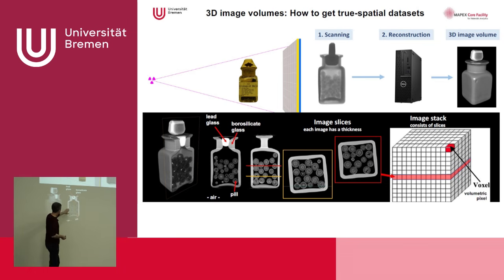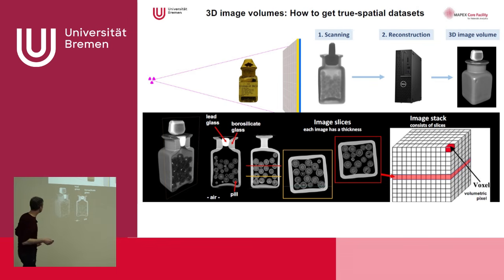We see that in the old days they were really milled and put together. So here we can really look into processes. Did the guys mill it a bit before they put these together, or is it just a bit coarse? Handmade pills for the sailors, and this is something that gives us information also about processes. How were these pills produced?